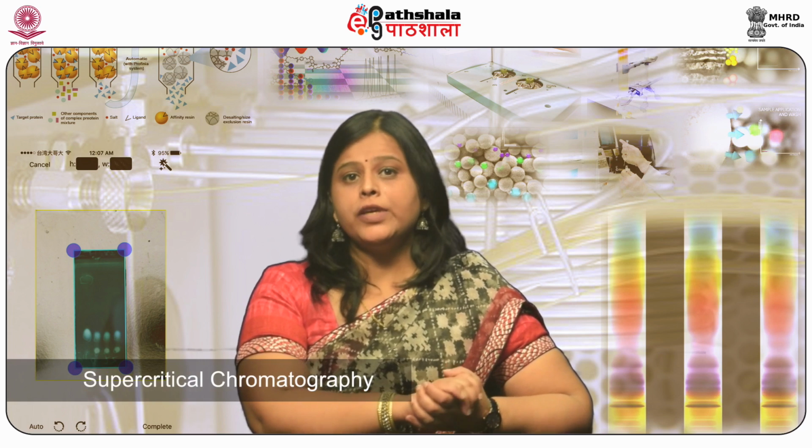Supercritical chromatography is gaining importance due to its numerous advantages. First, high speed analysis. Low viscosity and higher diffusion coefficients of the supercritical fluids allow quick and efficient separation. Second, low pressure drop across the column. High diffusion coefficients and low viscosity of supercritical fluids result in lower problems due to pressure drop across the columns.